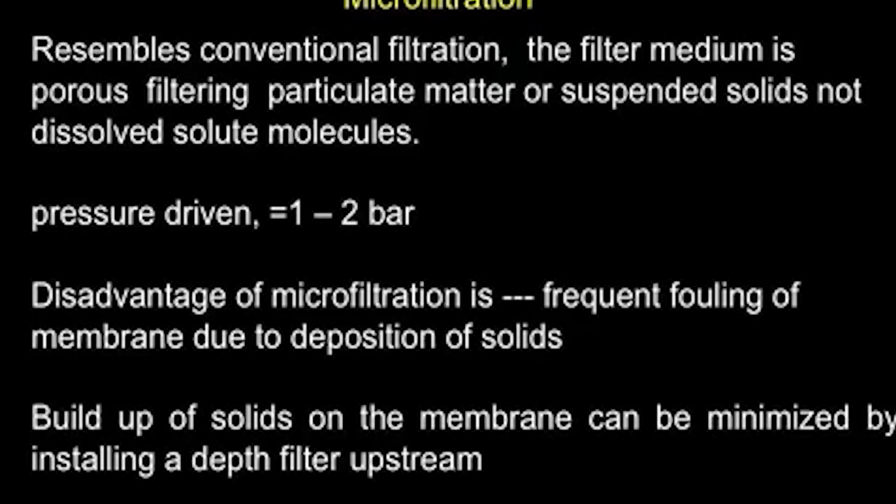So microfiltration does come across this problem, both the fouling as well as the deposition of solids. So build-up of solids on the membrane, how do you minimize it? We can have a depth filter upstream or a normal conventional filter upstream. So it will capture all bigger particles, and then you go to the microfiltration.